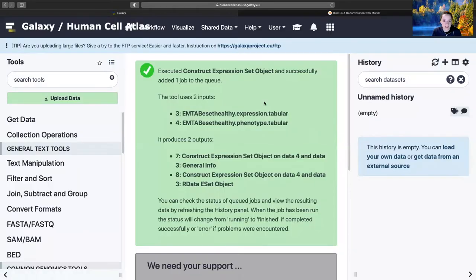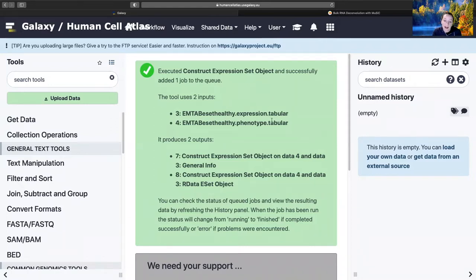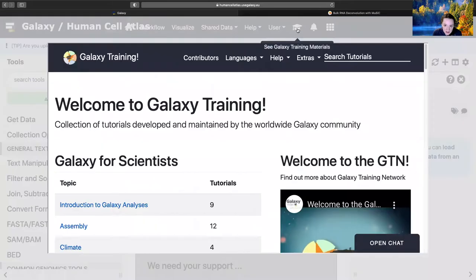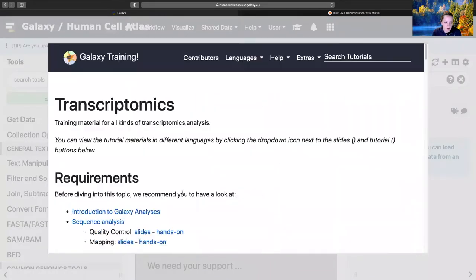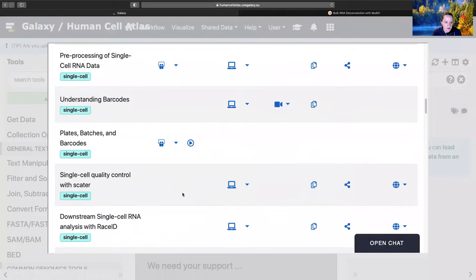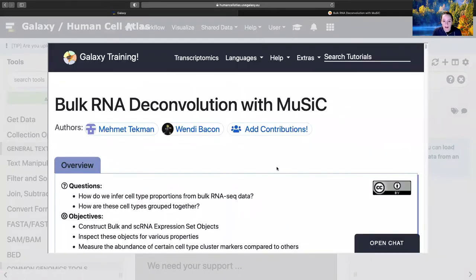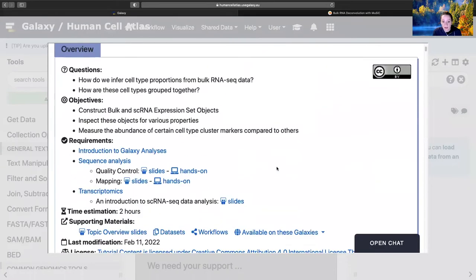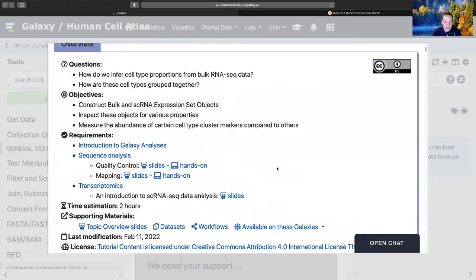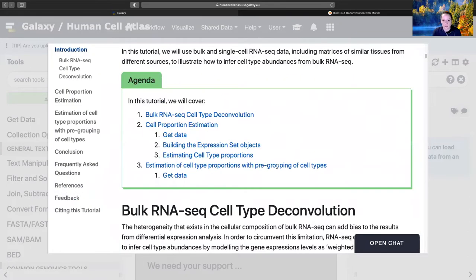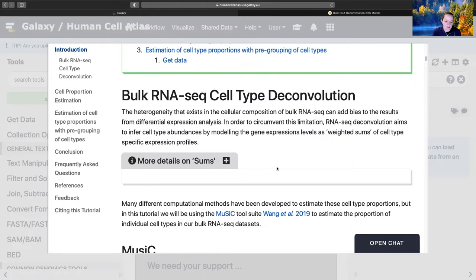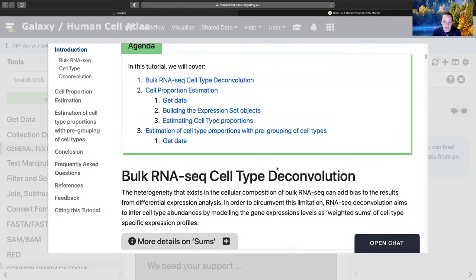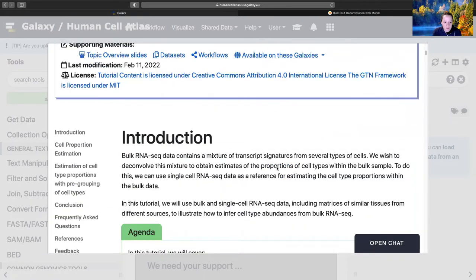So we're going to use the Human Cell Atlas UseGalaxy.eu instance. I'm going to use the tutorial view, using this button. You'll come down to transcriptomics, and then all the way down to bulk RNA deconvolution with music. This is going to be hugely valuable, particularly if you're not doing this in 2022, because it means you're going to be able to use the correct tools.